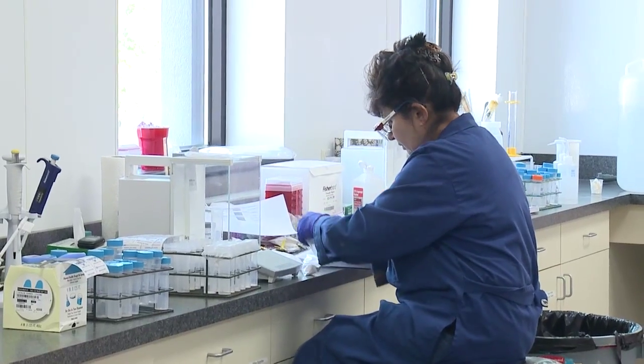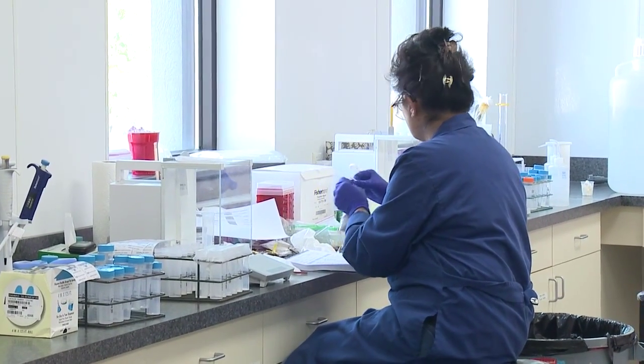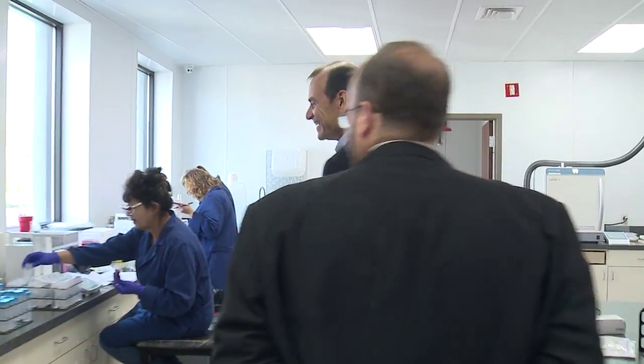Well, you'll see Elena. She's putting in, we typically use a quarter gram of material in a sample. That's our typical. We can use more or less at times. Just don't grab anything along the way. I'm not gonna touch.